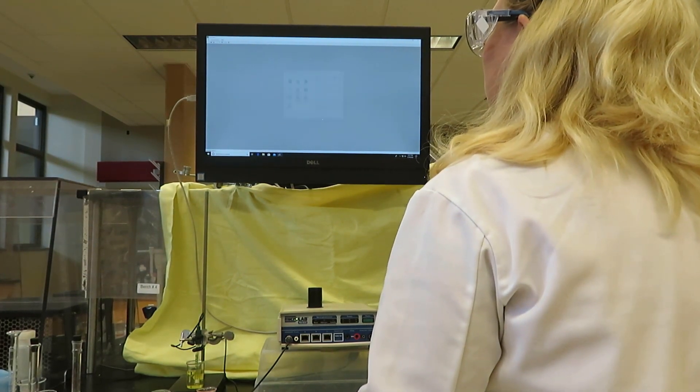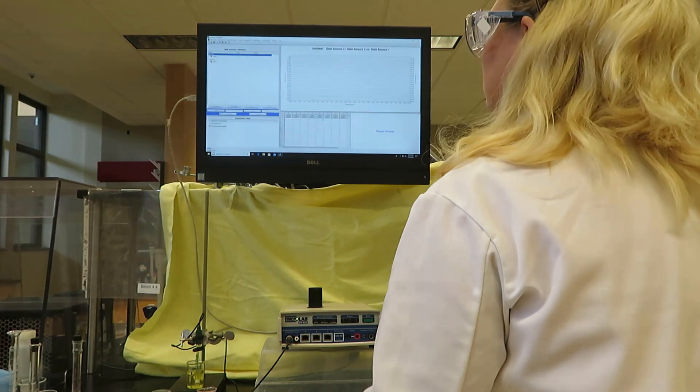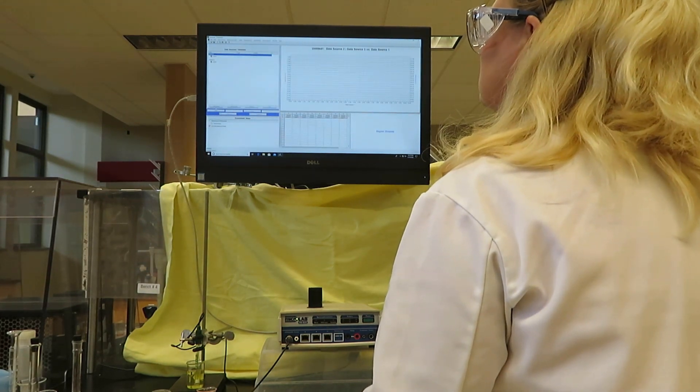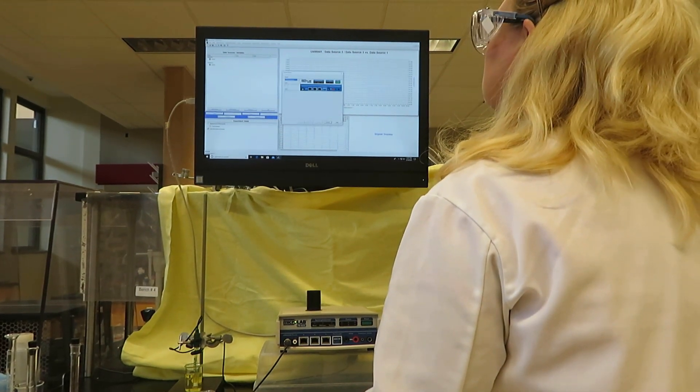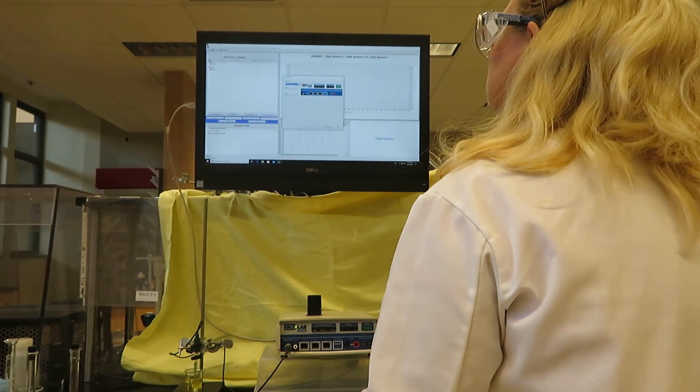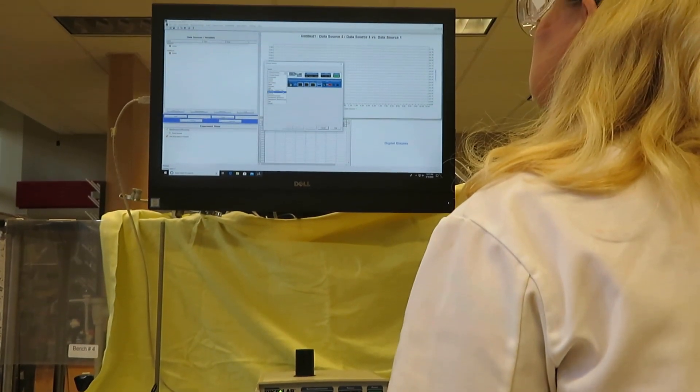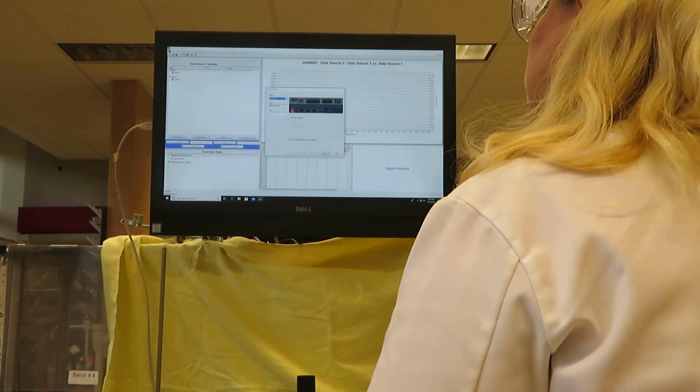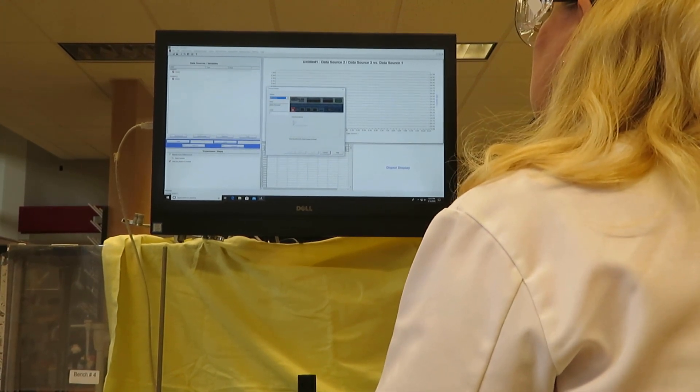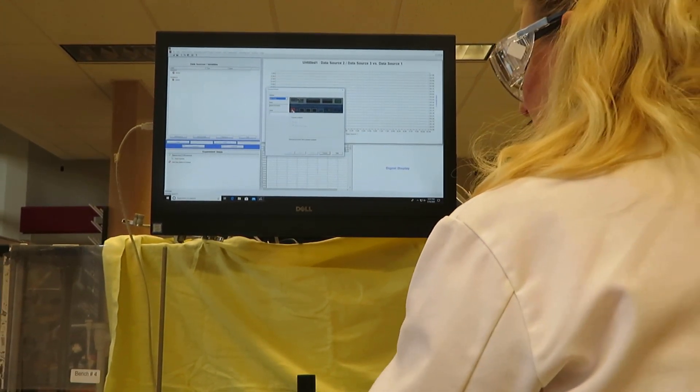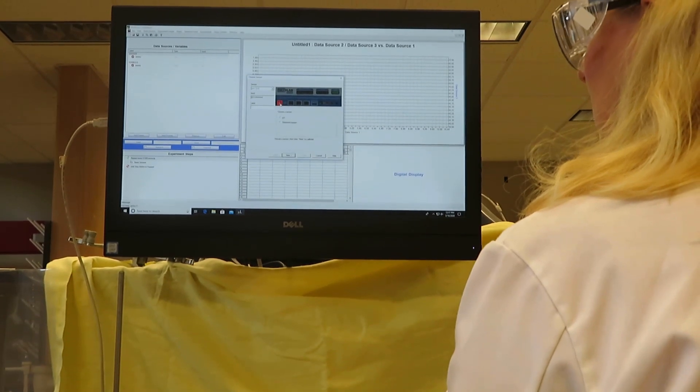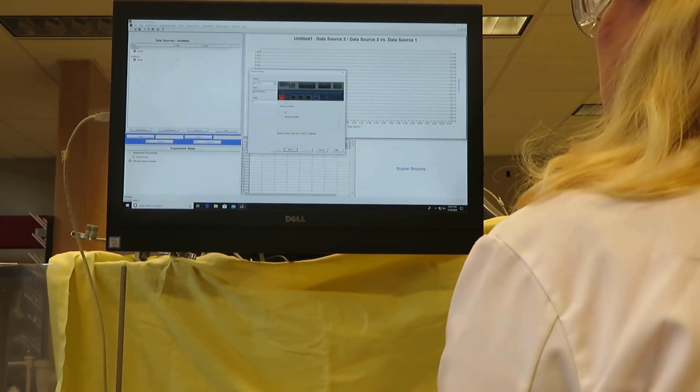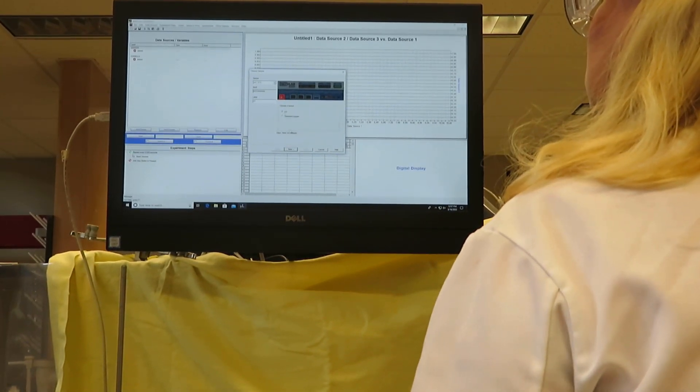We'll say OK to our Microlab experiment, and then add a sensor. The sensor we'll be adding is the pH or dissolved oxygen probe, and we will be using this connector on the Microlab to measure pH.